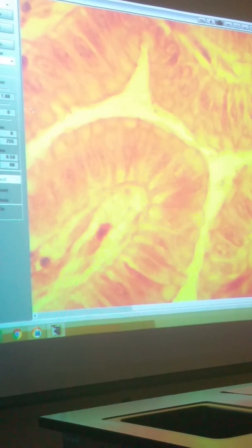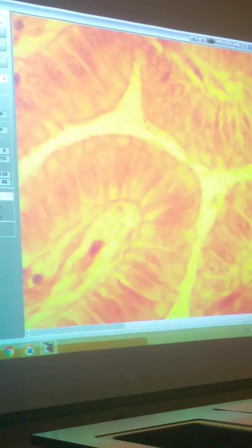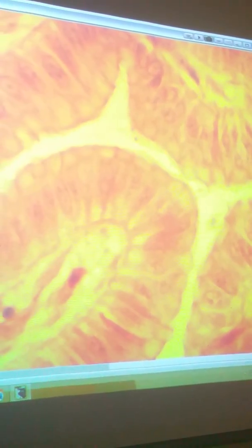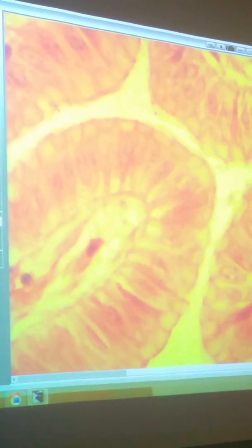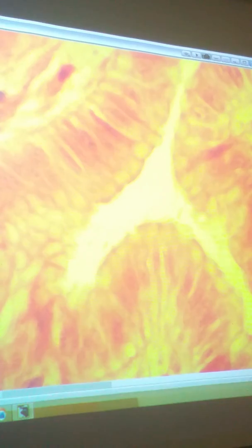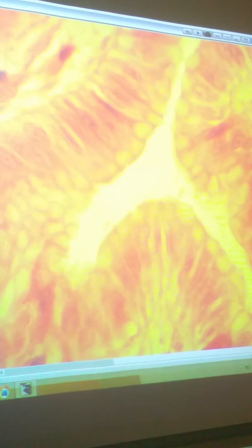Do you see these cells? All of these cells are simple columnar. These pink ones with the nucleus inside are the parietal cells. So is this in the lamina propria? Yeah, low down in the lamina propria. Right. The microscope shows it really well, but the computer doesn't show that well. So the pit will not be in the lumen. It'll be closer into the cell, just like the invagination, when the mucosa invaginates.